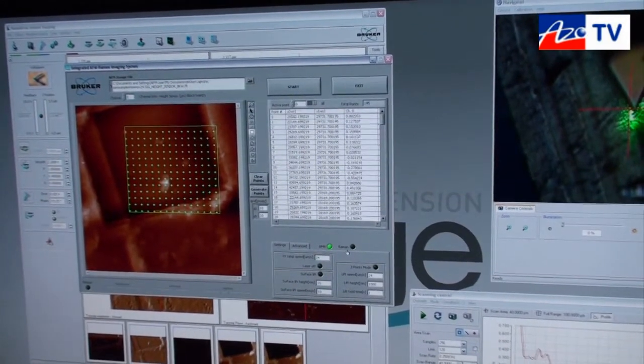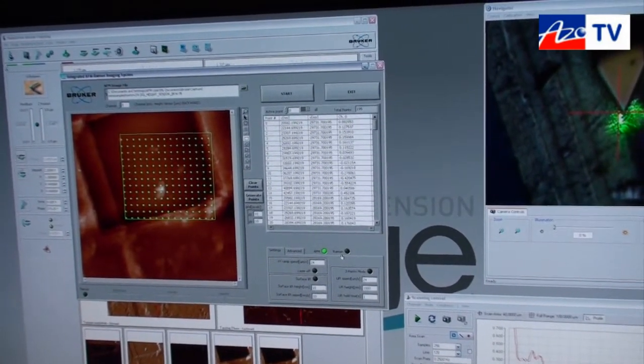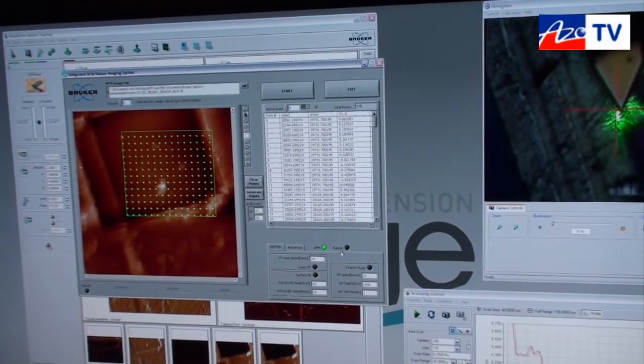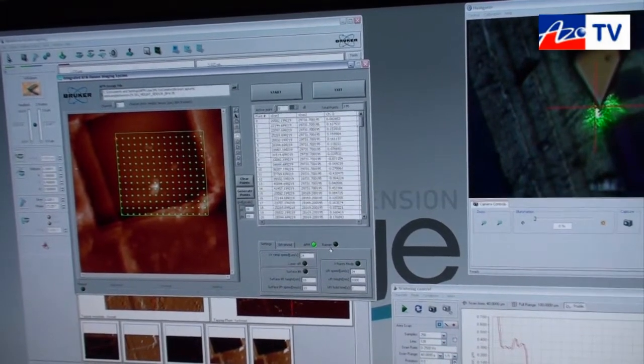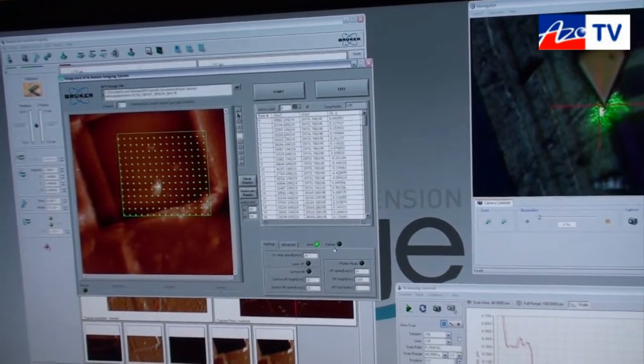This allows us to generate AFM and Raman data at the same time at the same location, which allows you to correlate topographic and chemical information on the same sample.